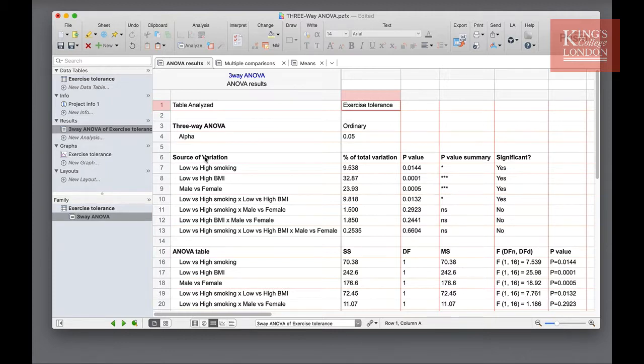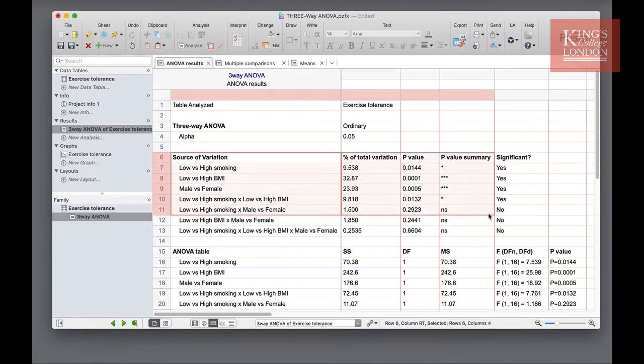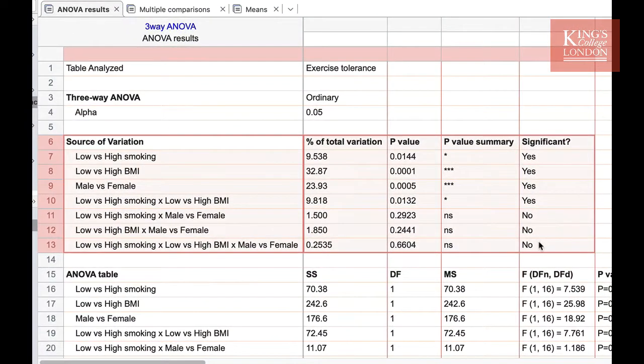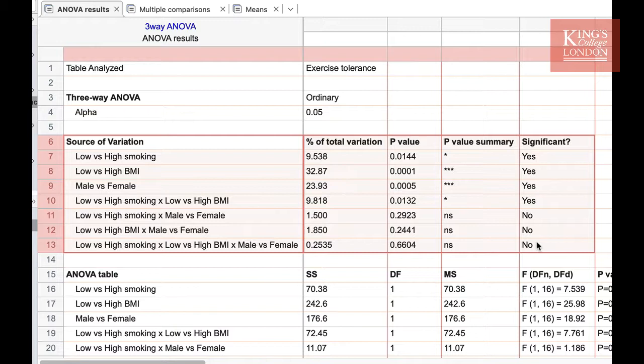For instance, if I highlight the section here that shows me the results of the ANOVA, we can clearly see that there is an influence of smoking, an influence of BMI, and an influence of gender on the outcome of this study.